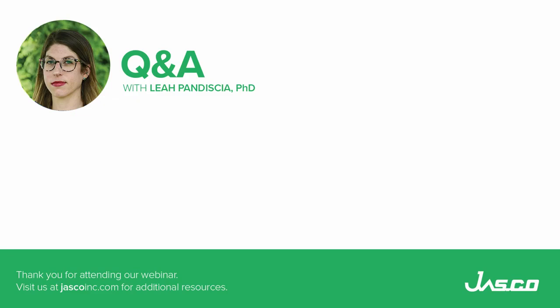And it's even more important, something I don't know that we talked as much about, right, Leah, when you have high absorbance, it's really important to not just do your baseline and then your sample, but you also run a dark, right? So you end up running 3 measurements. You run your 100% line, your baseline, and then you block the beam and run a dark current, just any background noise of the instrument. And then you run your sample, and that's probably the best for really highly absorbing samples.